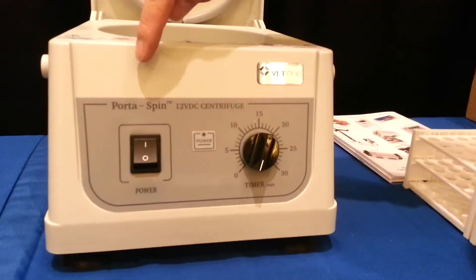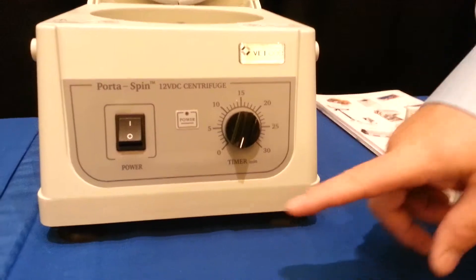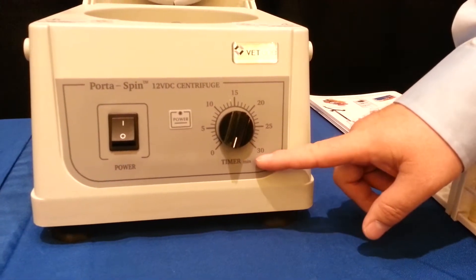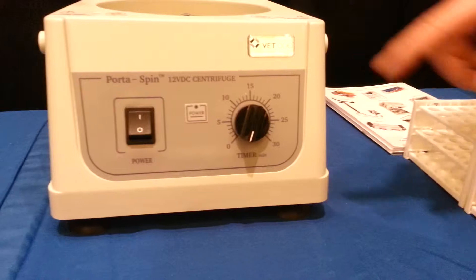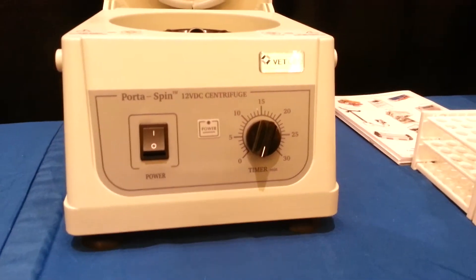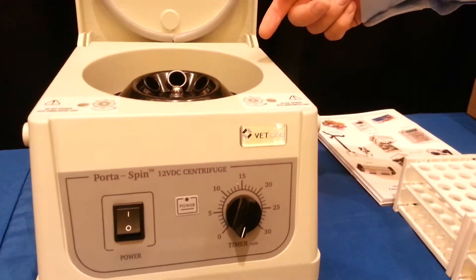You can see it's the Portospin. It has an on-off switch and an analog timer. It's a very simple unit to operate. It's part of the VET1 program. It's got a six-place rotor.